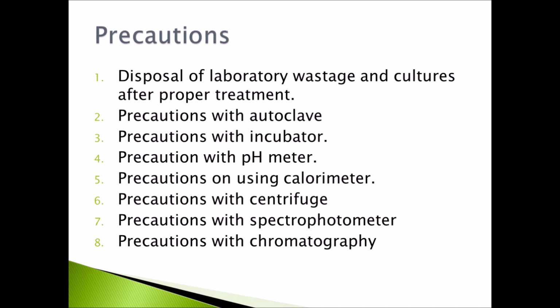Now, about a spectrophotometer. It is an analytical instrument used to measure the transmission or reflection of visible light, ultraviolet light, or infrared light.